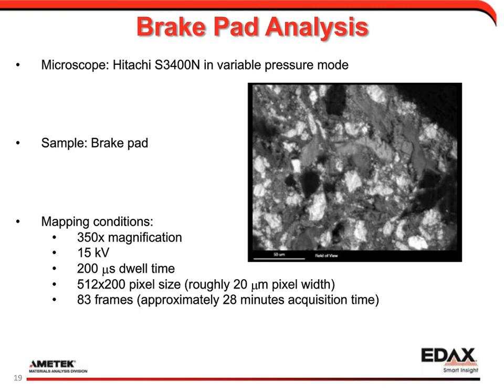Typically, you get X-rays from a cubic micron-sized area, and you can see nanometer-sized particles, so it doesn't really affect much. But if you go to very low acceleration voltages, you start to see some of these effects, where in principle you'd have much better X-ray resolution because your interaction volume is shrinking, but your beam size will actually play against you in that.